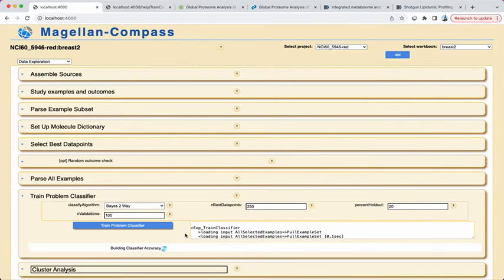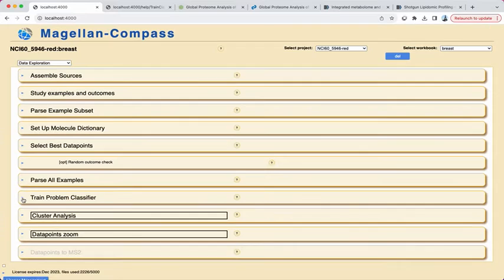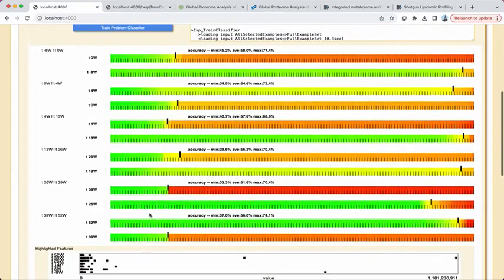In some instances, molecular identity is far less critical than the ability to determine sample classification based on the expression pattern within the mass spec data. Here, using COMPAS in a feature-first workflow is ideal. COMPAS is designed to use machine learning classification to identify data points with strong connections to biology. Trained classifiers emerging from this step can then be directed towards data sets from samples with unknown classification, predicting their classification with defined accuracy and confidence parameters.